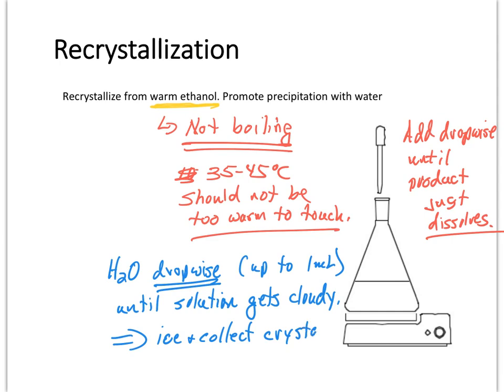So we're going to modify our recrystallization procedure just a little bit. So this is your pre-lab lecture for the first lab that we're doing this coming week. You do need to come to lab prepared on Monday and Tuesday. If you have any questions, please let me know.